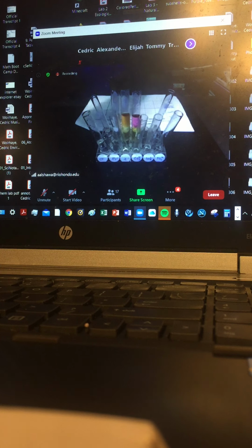So just make sure. Hexane. More drops. Okay, so hexane is a little more obnoxious as far as the smell. So this is the outcome. Let me cap it one more time.